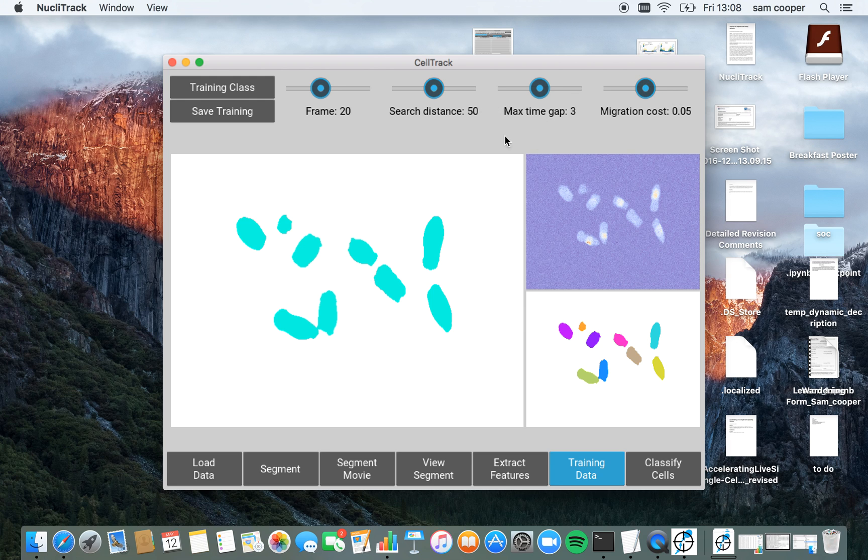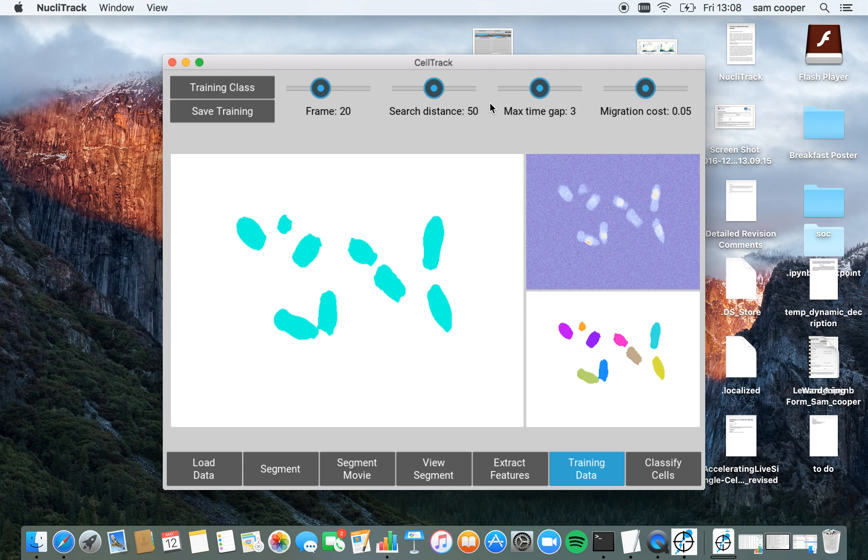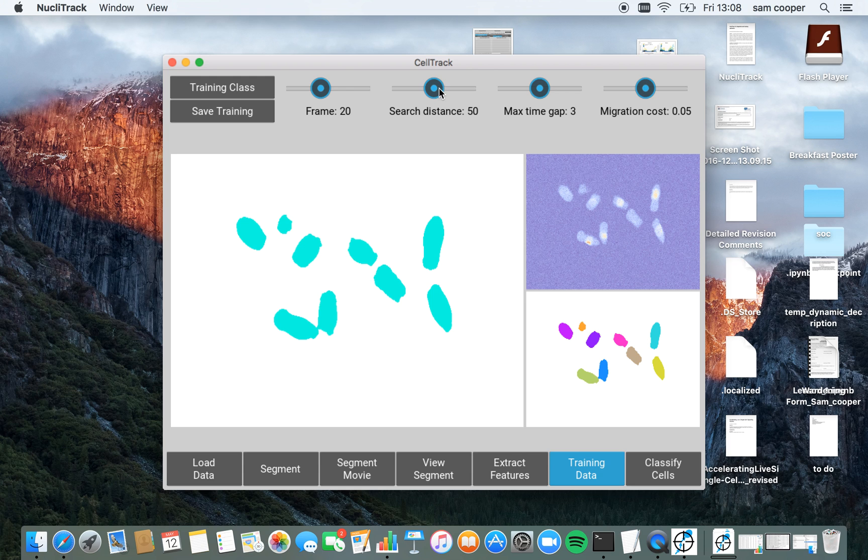NucleoTrack is also able to handle cases where a segment or a cell disappears from a frame or two. And this parameter here controls the maximum number of frames that a cell can be missing for before NucleoTrack loses the track and has to restart it. So I know that these parameters work quite well for this video, so I'm just going to leave them as they are.